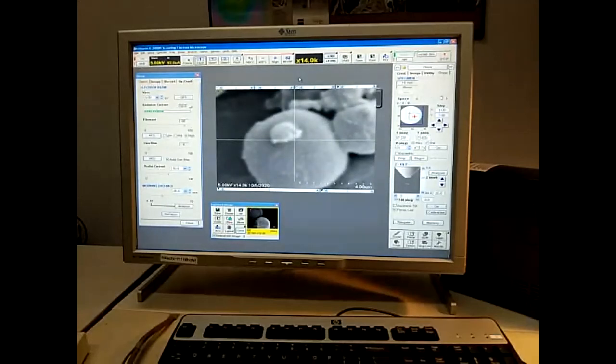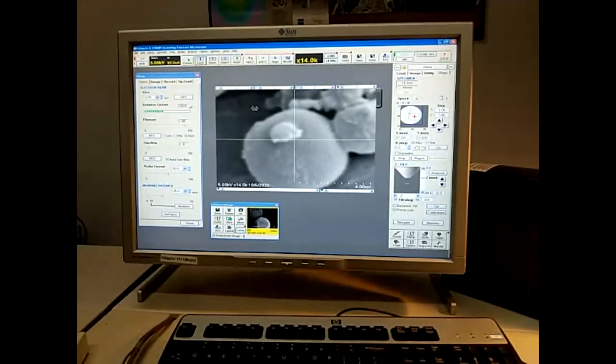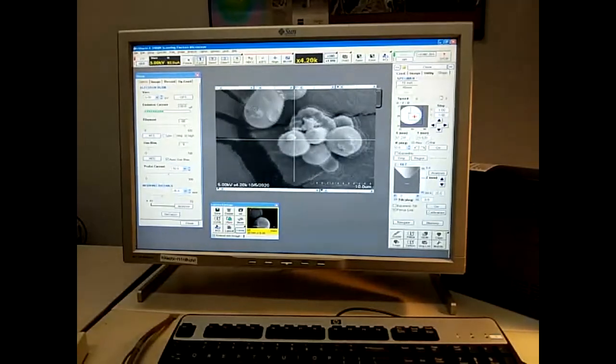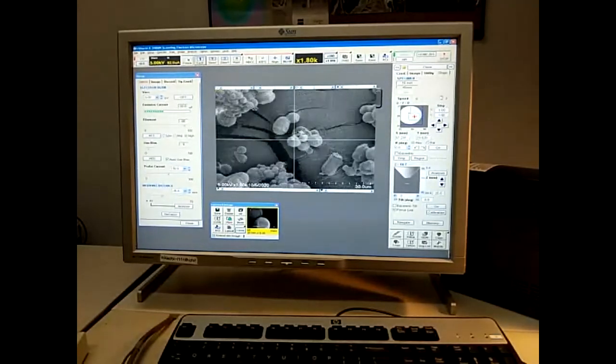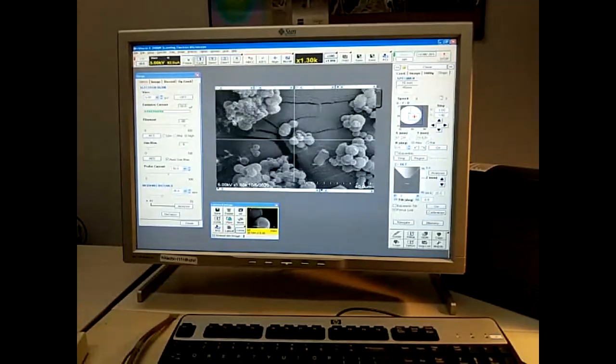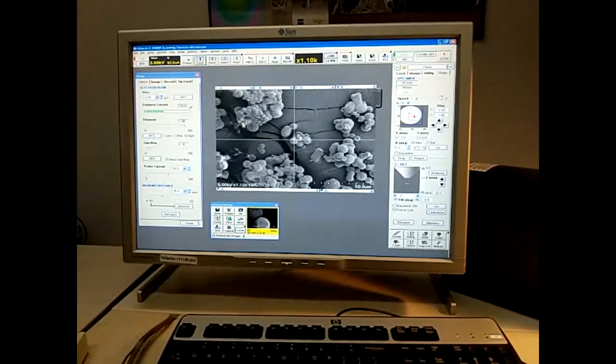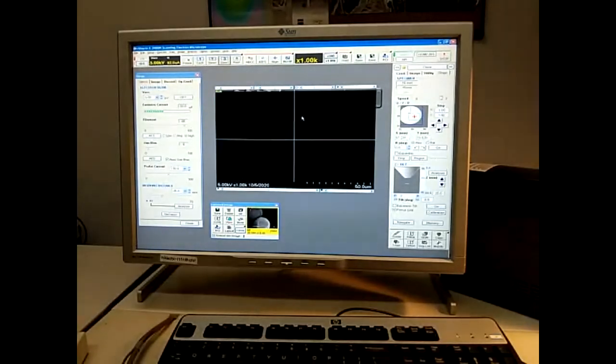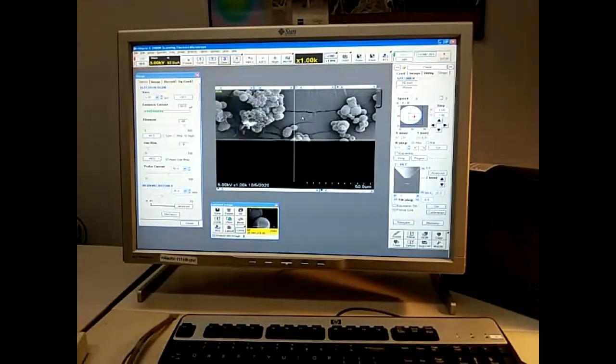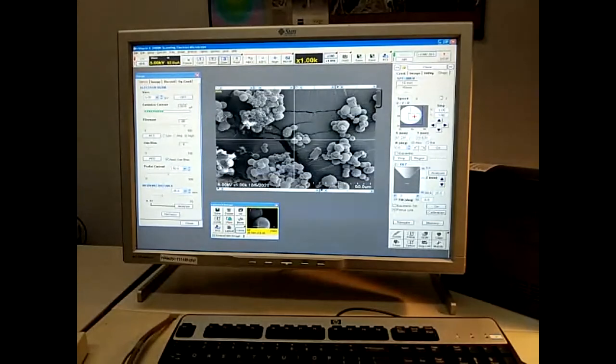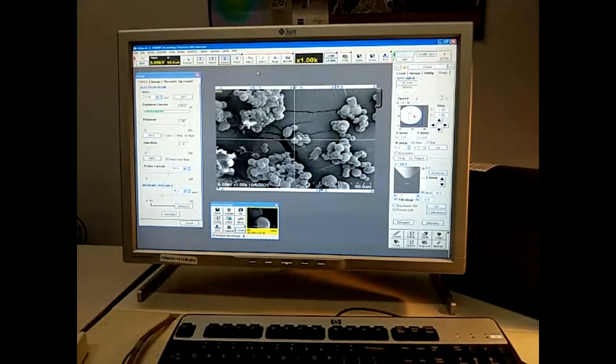Not really meant for higher magnification imaging. Again, you would want to go with the lower probe current and higher kilovolt settings. So this is really meant more for lower range imaging, around 2,000 times. There's a little bit of charging artifact. This is a borrowed sample. Okay, so we'll pause that there and I'll switch to another setting.